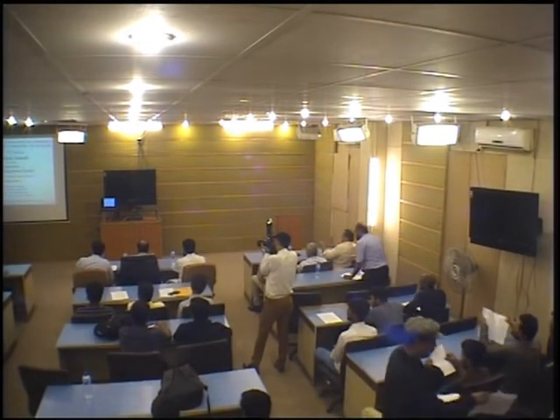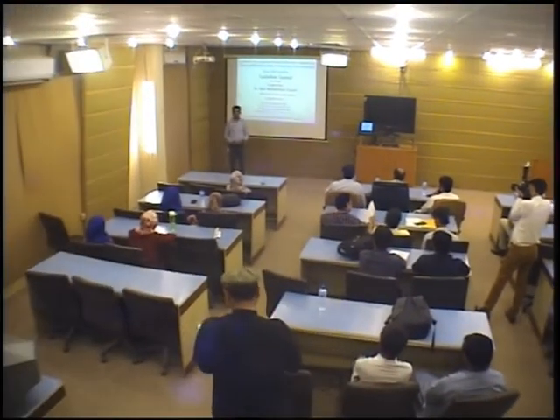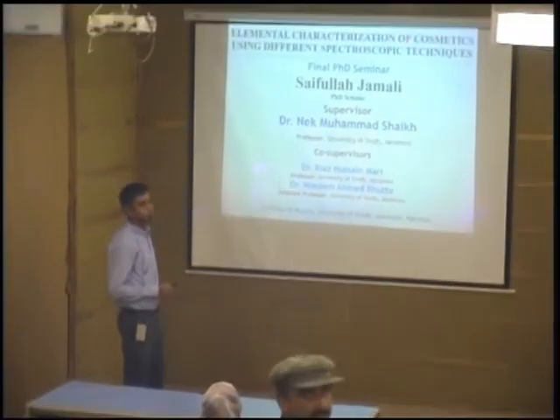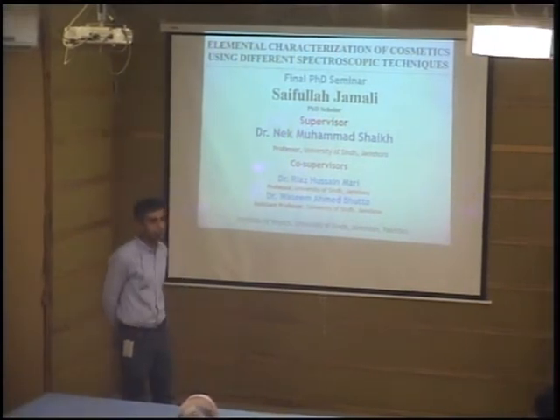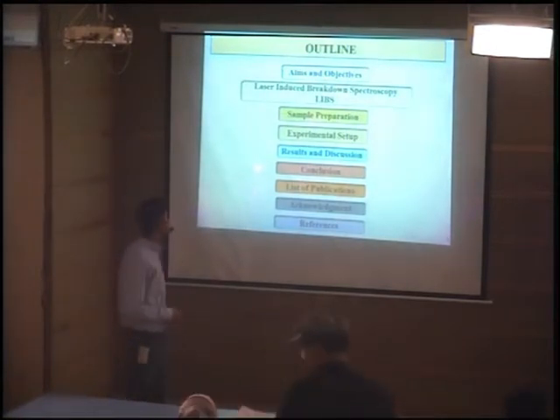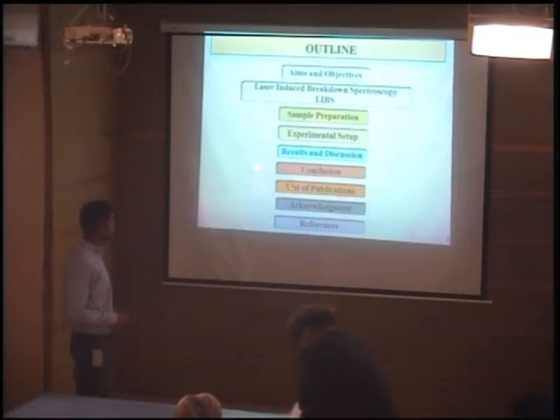Respectable expert, doctors, teachers, and dear students, I, Saifullah Jamali, today present my final PhD seminar under the supervision of Dr. Nek Mohammed Sheikh. My research topic is elemental characterization of cosmetics using different spectroscopic techniques. I am working under the supervision of Dr. Nek Mohammed Sheikh and co-supervision of Dr. Riaz Hussain Mari and Dr. Wasim Ahmad Bhutto. The outline of my seminar consists of aims and objectives, laser-induced breakdown spectroscopy (LIBS), sample preparation, experimental setup, results and discussion, conclusion, list of publications, acknowledgement and references.